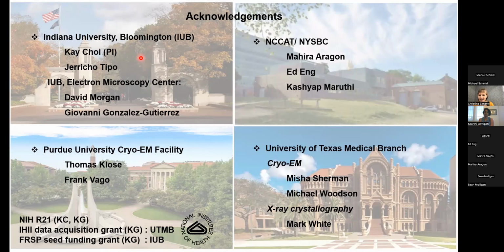I want to say I'm not seeing different views because of ice thickness. We either lose contrast or we see the particles, but just the thickness of ice doesn't seem to change what we are seeing in terms of orientation that much.